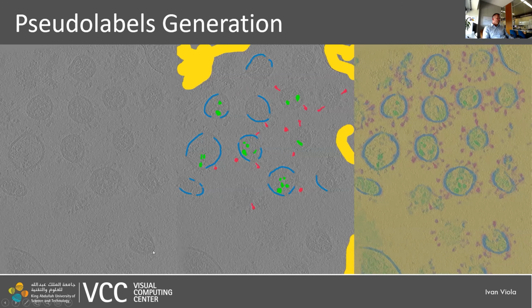I'm very excited about your work to combine differentiable rendering simulation with electron Cryo-EM tomography. This is really cool. I'm wondering, is it possible in the future to put this kind of technique into the tomographic hardware device? Then we can improve the imaging quality while generating segmentation results automatically.